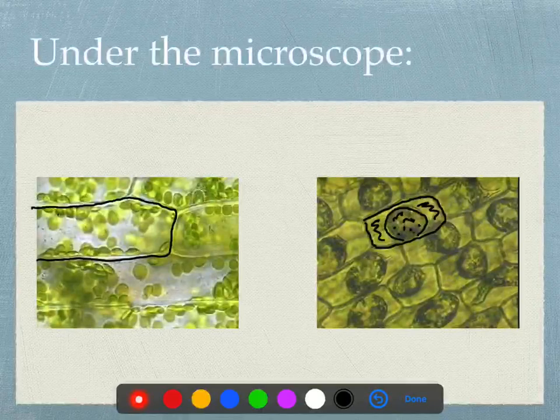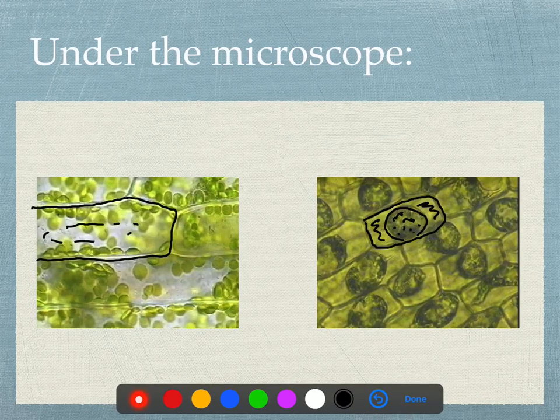Whereas in a happy plant cell that's in 100% water, the central vacuole is somewhere in the center, right? You can't really see it, somewhere in here. But it's filled with water and it pushes all the chloroplasts to the edges just underneath the cell wall. And they're swimming around, they're having a good time. All right, so that's the difference between salty water and 100% water in the case of plants.